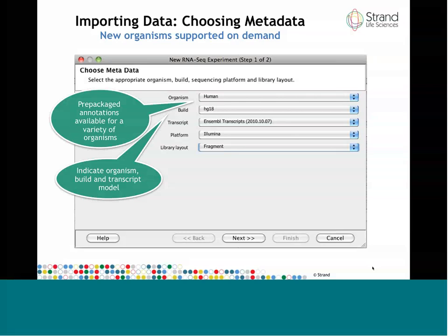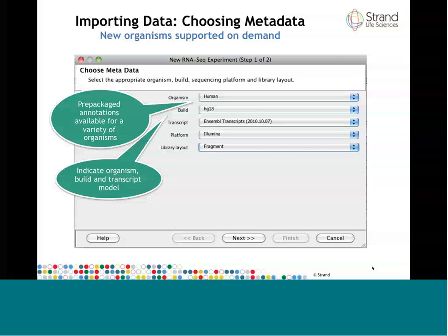In case you're working with an organism or a build which is not available when you look for the annotations from Avadis NGS, feel free to get in touch with us. We've been quite good about responding to needs on demand as people request interest in working with specific organisms or specific builds.